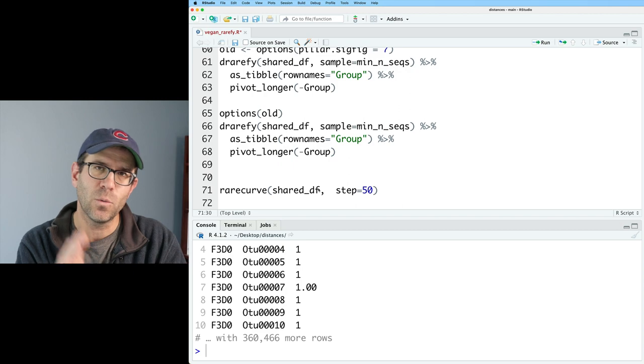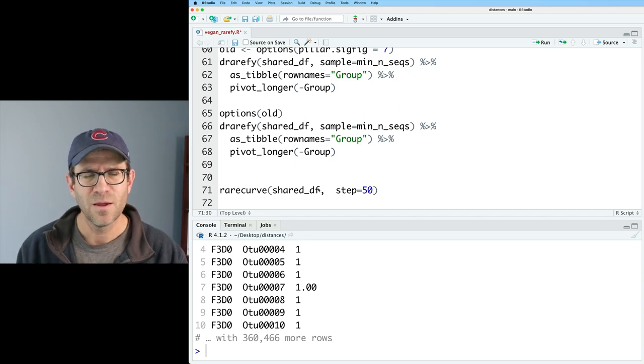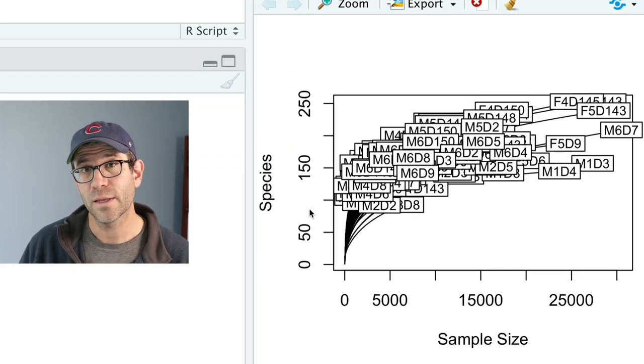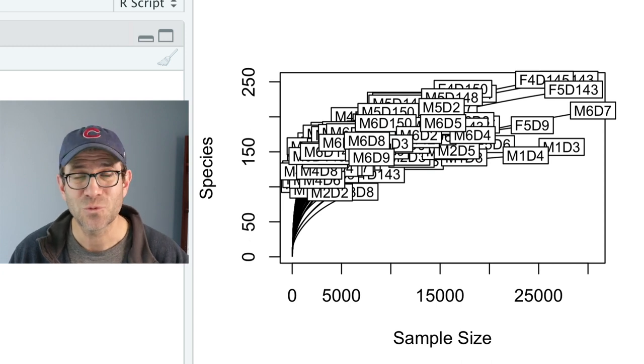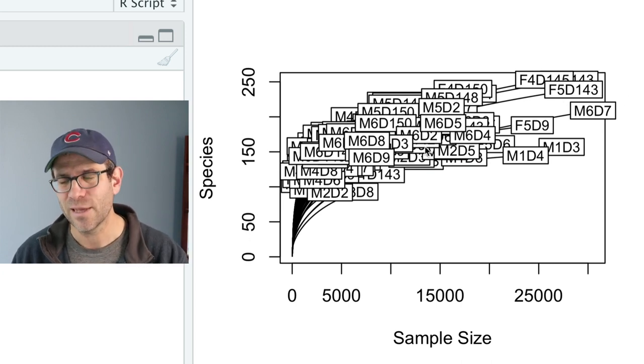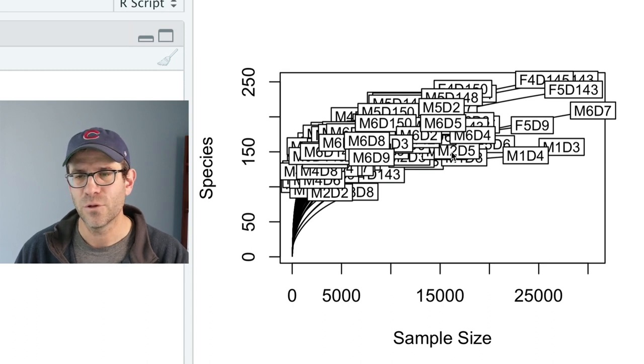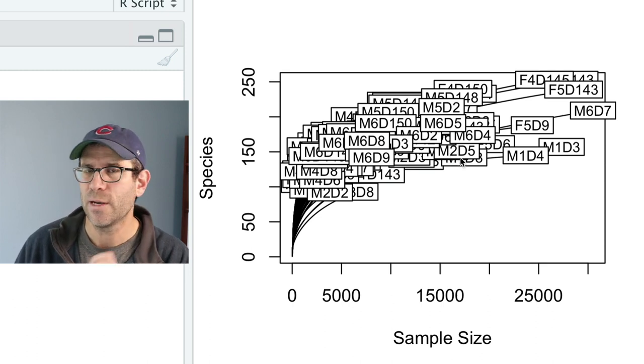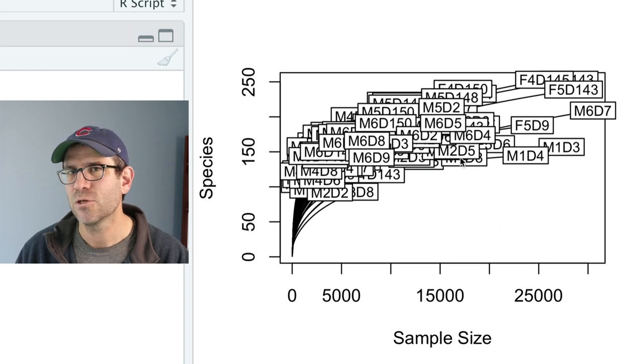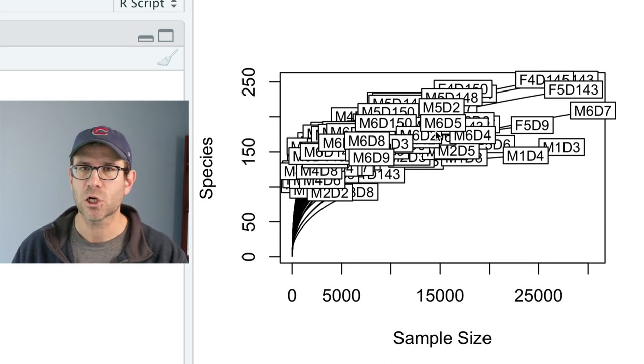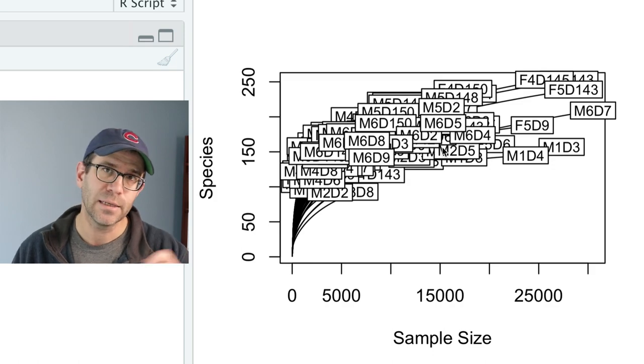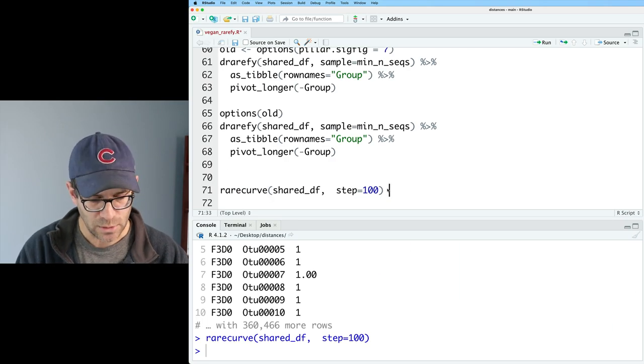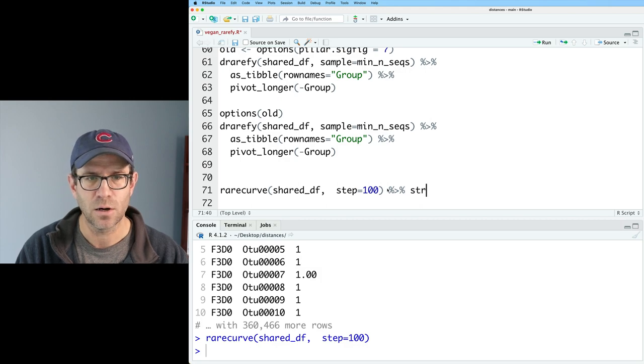What we get out of rarecurve is those 227 rarefaction curves, and we get a text box for each sample on top of those curves. This is a figure that's generated in base R. I'm not interested in using base R. I'd like to know how I can get the data for the curves out of base R and into ggplot2. And so what I'll do is I'll go ahead and pipe this into str.